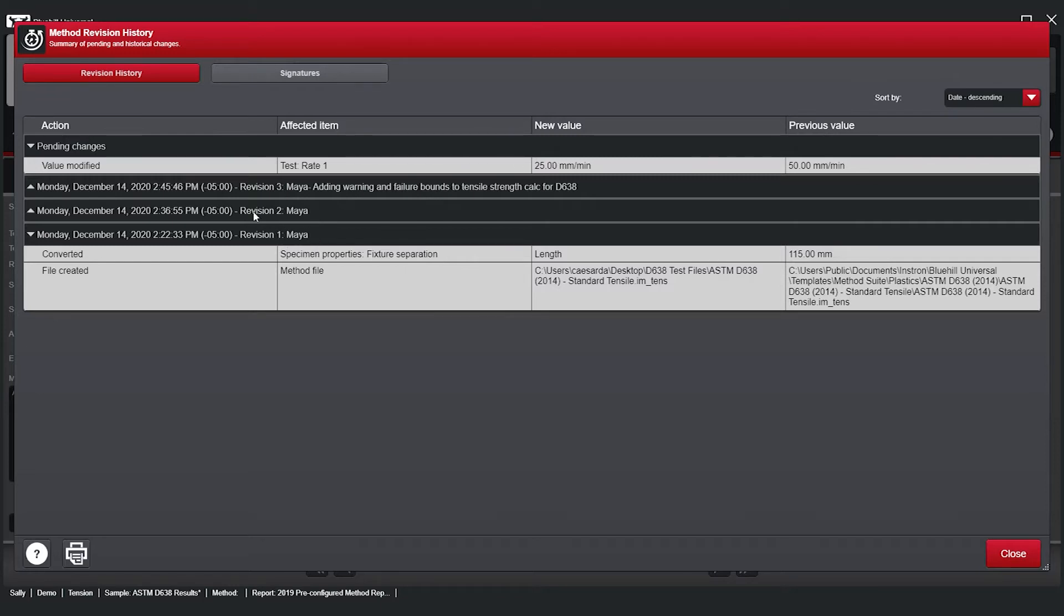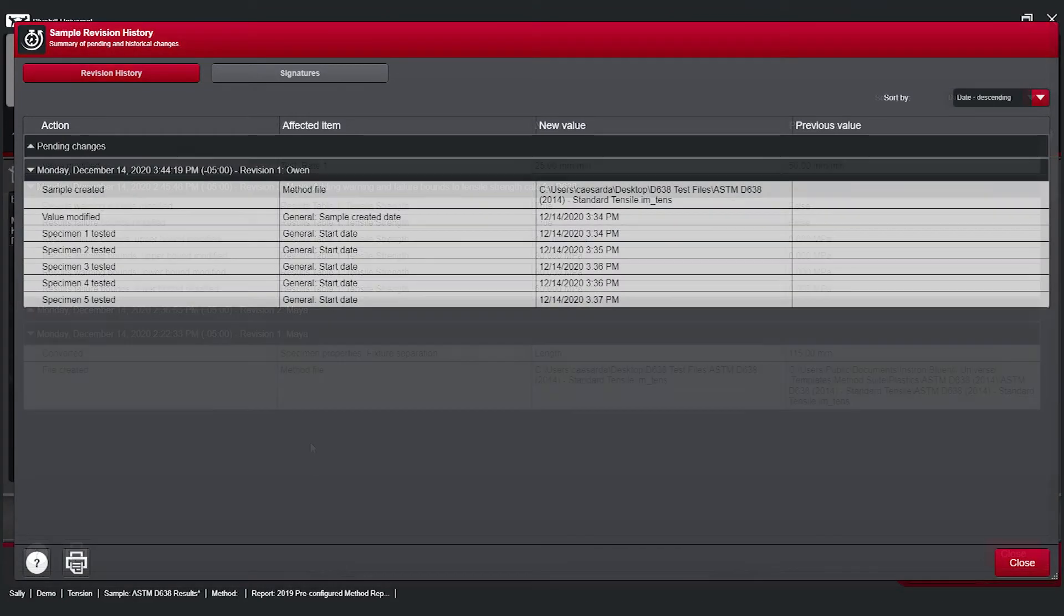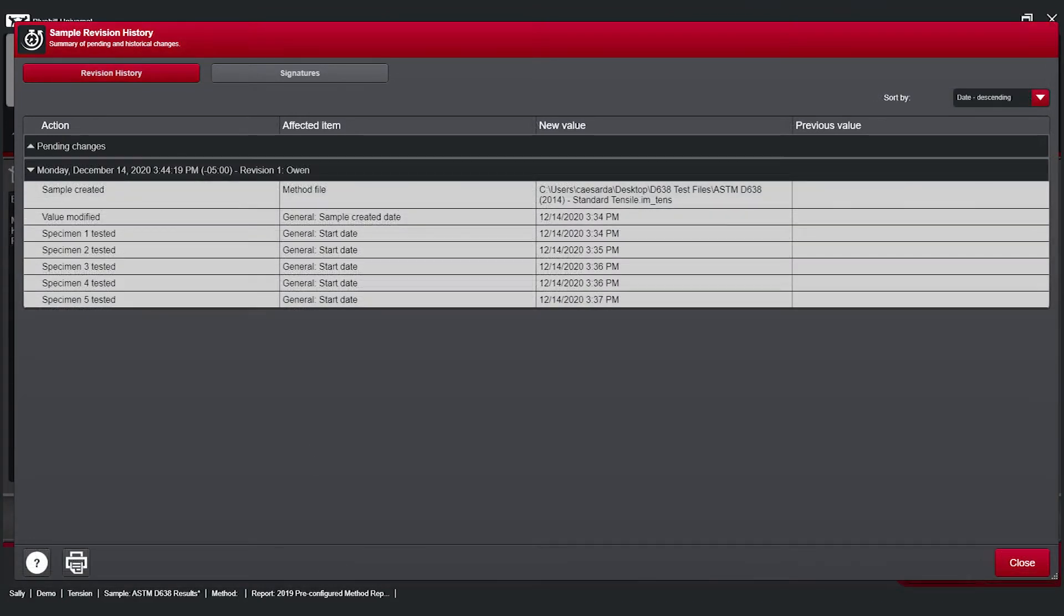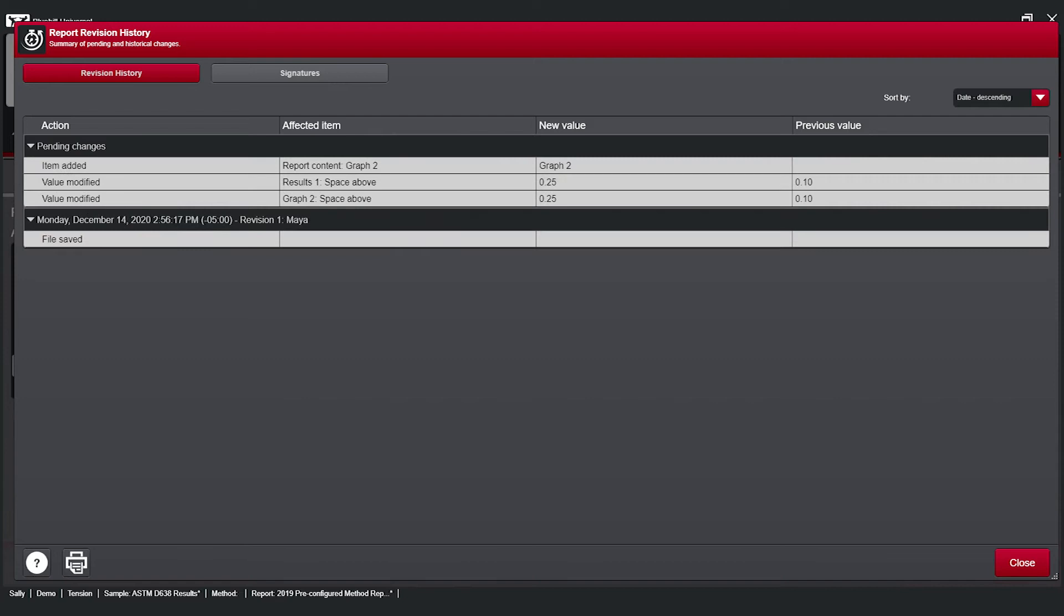In addition to approved changes, pending changes can be observed in the log. Revision history is available for three Blue Hill file types: methods, as we've shown here, but also for sample files and report template files.